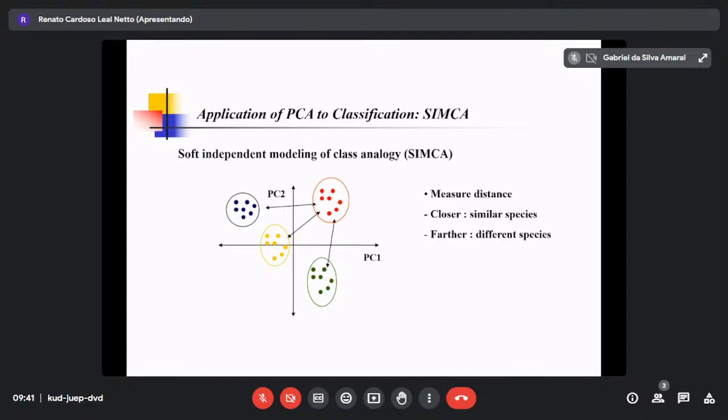Now, you have a very limited number of samples, for example 45. But sometimes some species have a lot of samples, and some species only 1 or 2. In that case, if you do phylogenetic trees, they say the numbers are not well balanced. Some have a lot, some have few. In that case, maybe you can change the approach: build a model from the sample which has enough samples, and check whether the other samples are close or not. That is also possible.